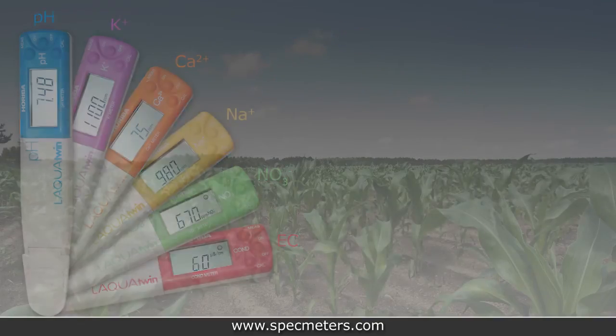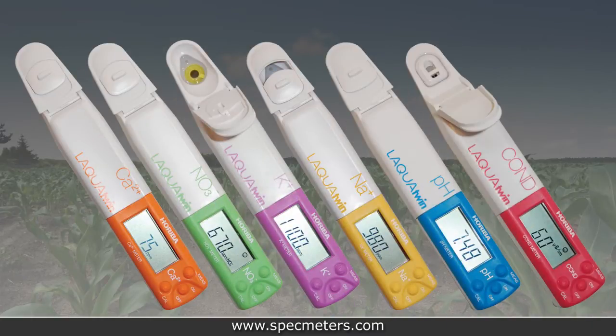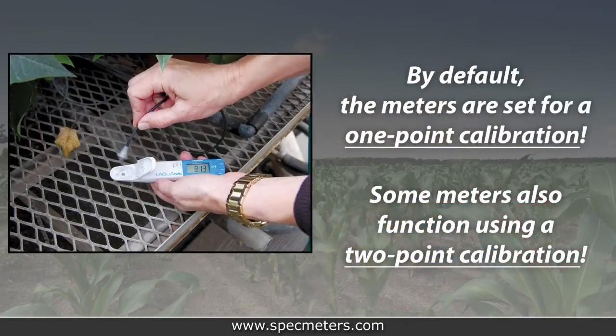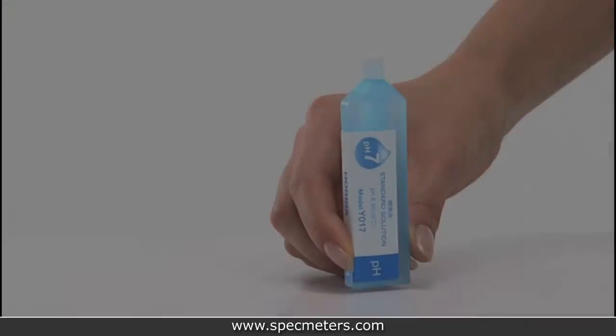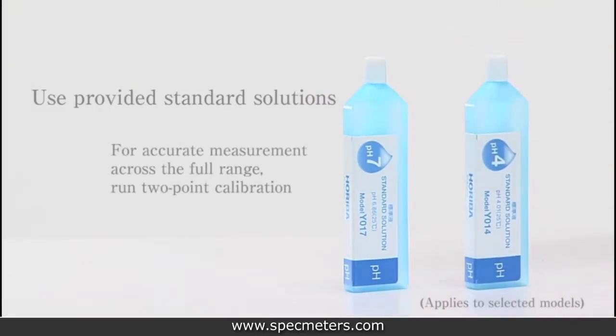The Laqua Twin family of meters includes calcium, nitrate, potassium, sodium, pH, and EC. By default, the meters are set to a one-point calibration, although they also function using a two-point calibration. Each of the Laqua meters is provided with standard solutions. For a more accurate measurement across the full range, run two-point calibration.